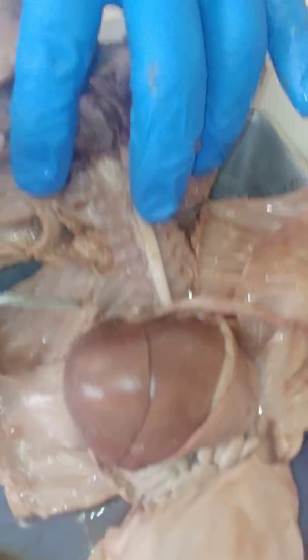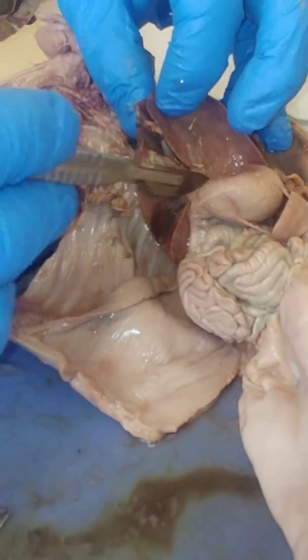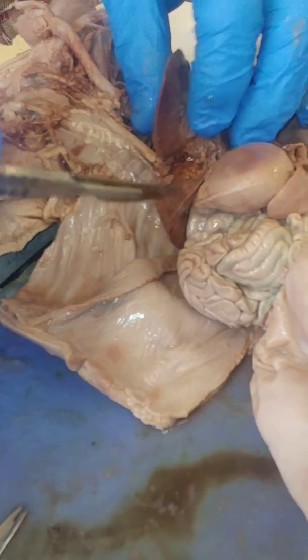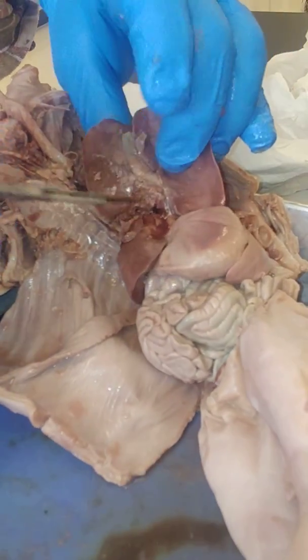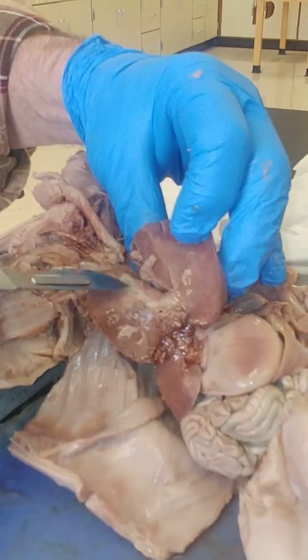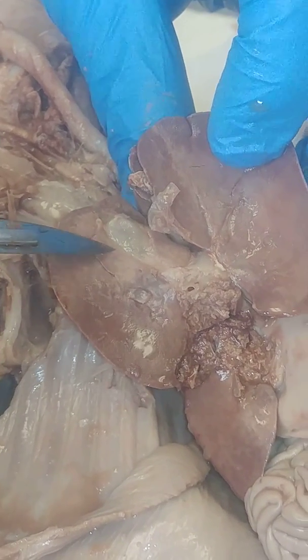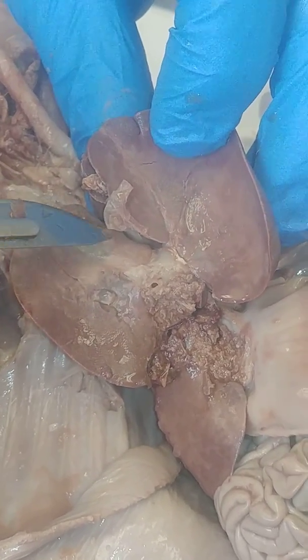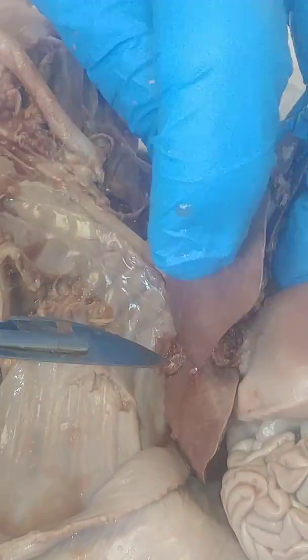So we've taken care of the upper part now. We're going down to the lower part. And you've got the liver here. And we'll try to get this removed. And we've got several lobes to the liver. And before I even go any further, there's a little sac-like thing right here. If you remember from your frog, it was like a little green ball, a greenish colored ball. Okay, it's a little more oblong right here, but that's the gallbladder sitting right in there.